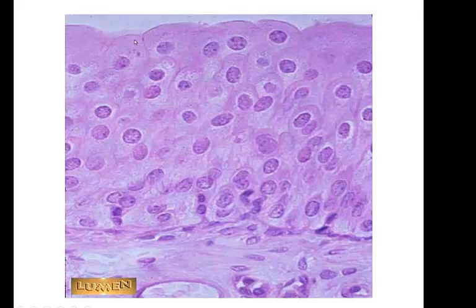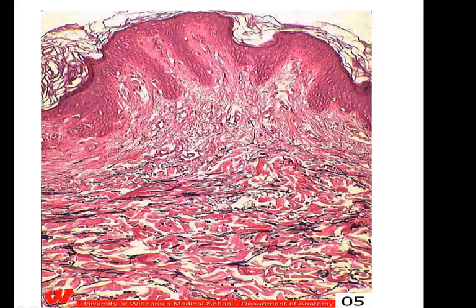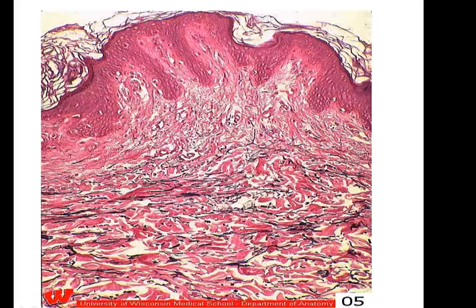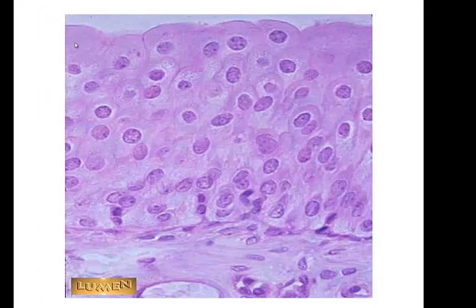The way you identify this is it looks dome-shaped. So you can say that its function is distensibility and its location is the bladder. Did I give you a function on this one? The function for both of these, for all the stratified squamous, is going to be protection. The location for this one, which I did not give you, was the skin, for the keratinized stratified squamous epithelium. Forgot to give you that. So there's our transitional. To figure out transitional, look for dome-shaped cells at the top. See these big puffy cells? Then you'll know you've got transitional.